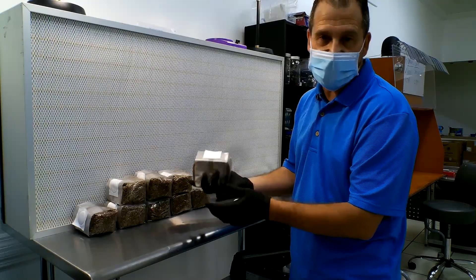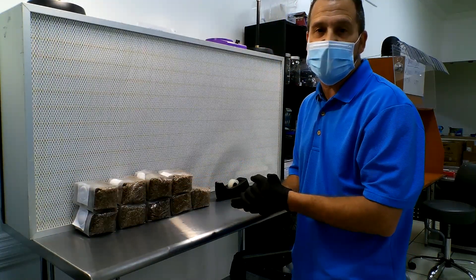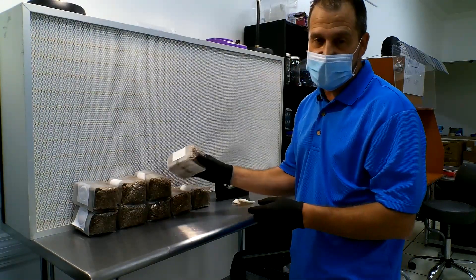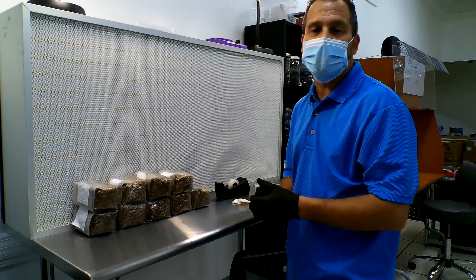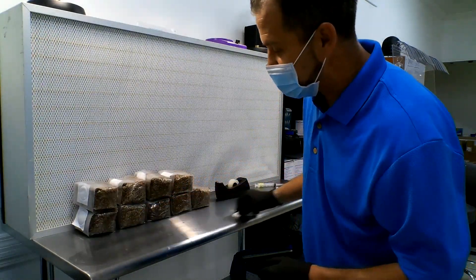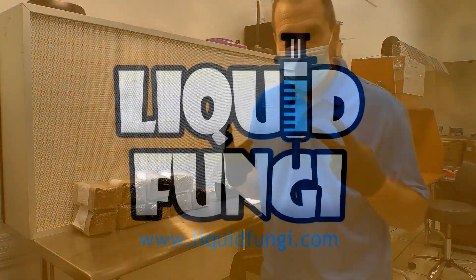This is simpler, and these bags are cheaper. The tape is cheap; injection ports are expensive, and if you buy bags that have injection ports it's very expensive as well. These are about 20 cents a bag and the injection port bags are $1.25 — so a lot more money to buy those. I find injection ports tend to get pulled off or leak air, so I have a lot more failures with injection ports than doing it this way. Anyway, that's it. Hope you enjoyed it. Make sure you visit us at liquidfungi.com. Peace.